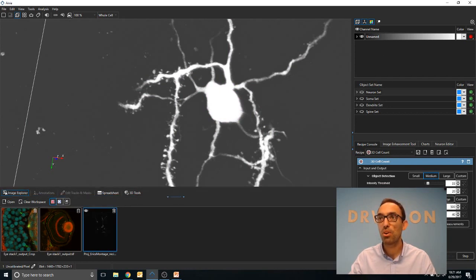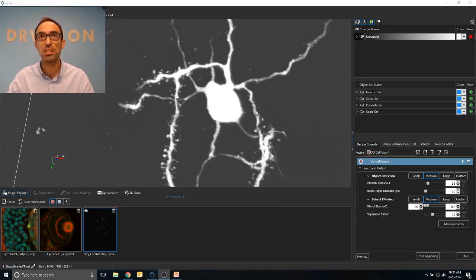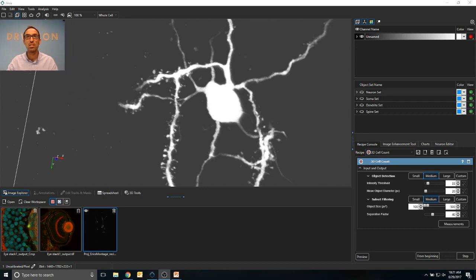So I hope you can already see Aivia. I'll just rearrange my window a little bit. I don't need to see me that much. I can leave it there.